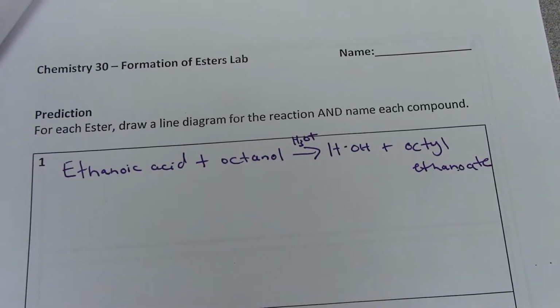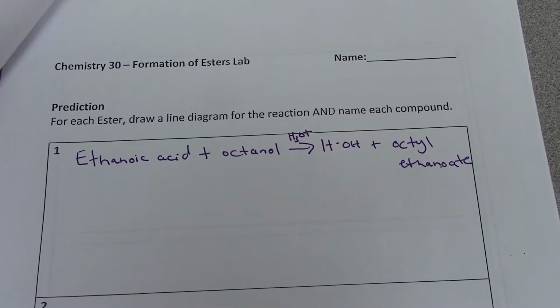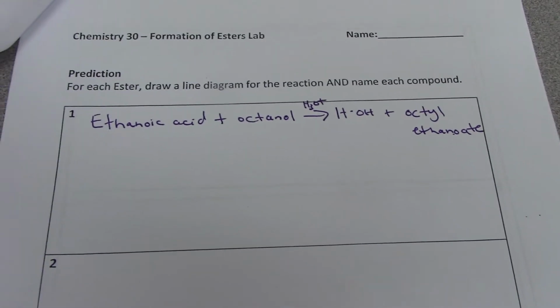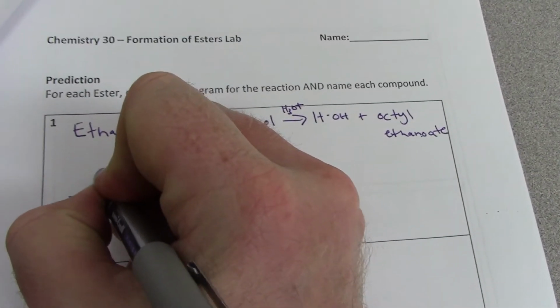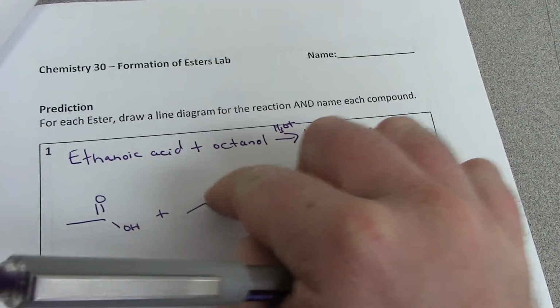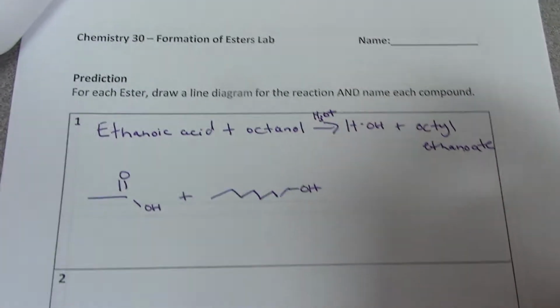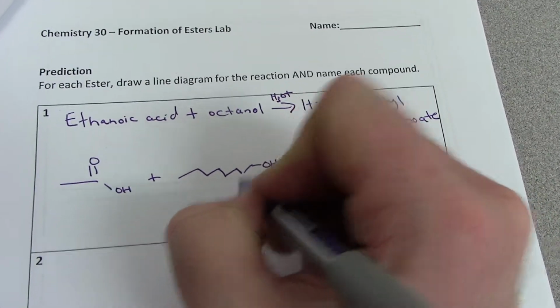Remember, the alcohol becomes YL and the carboxylic acid becomes OATE, so octyl ethanoate. Then draw the correct structural diagrams for the reactants and the products. So ethanoic acid is going to look like this, plus octanol, and there's an OH attached to that. I'm going to use sulfuric acid.